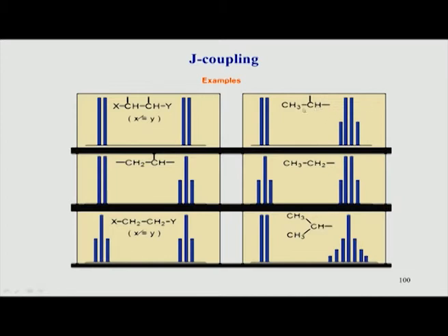Now, if you look at this side here, what is happening? This hydrogen has 3 hydrogens as neighbors, but all the 3 are equivalent, it does not matter. As far as this hydrogen is concerned, it sees 3 hydrogens in its neighborhood, and because they are equivalent, it has the same coupling to all of the 3 hydrogens, and therefore this hydrogen will get split into 4 peaks by the n+1 rule. The n+1 rule says that this hydrogen, which I am indicating by the arrow, gets split because of this CH3 into 4. Now, look at this pattern here, it looks like a very strange pattern, but how does it come? We will see in a few slides from now how this pattern can be derived mathematically. It is very easy to do that.